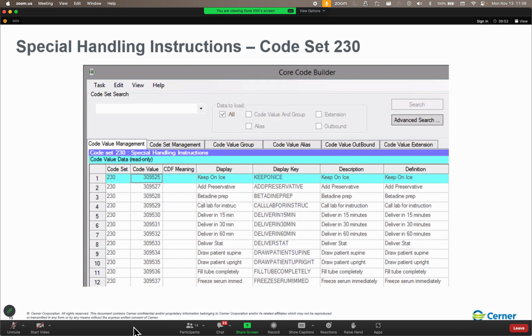Now, why am I talking about that in the laboratory class? In order to be able to say this: please do not inactivate the generic specimen types for radiology or anatomic pathology, or you will break those solutions. Please don't do that. Now, specimen types, again, really should be added in the sources tool in MICDB tools.